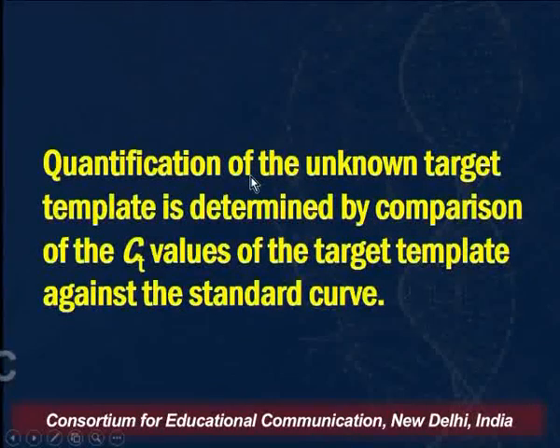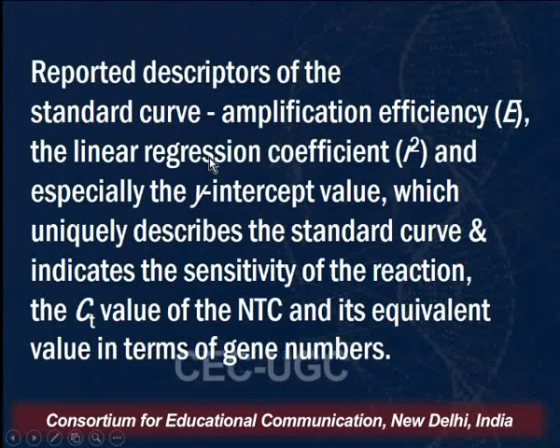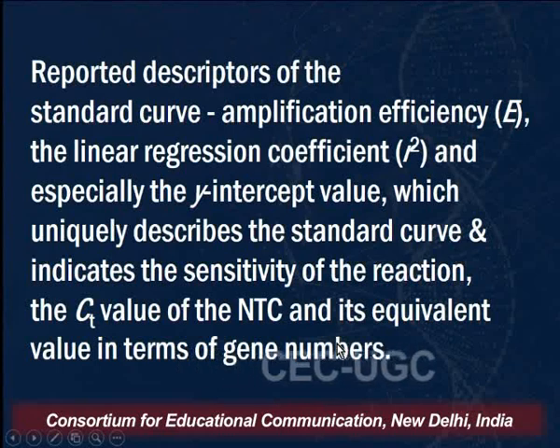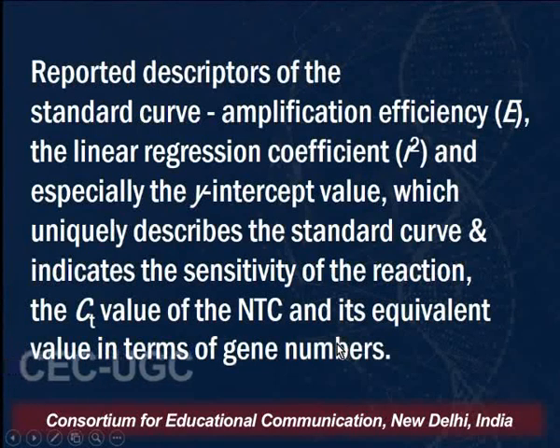As I said, some of the reported descriptors of the standard curve are the amplification efficiency, the linear regression coefficient, and especially the y-intercept value, which uniquely describes the standard curve and indicates the sensitivity of the reaction. The CT value of the NTC and its equivalent value in terms of gene numbers are also given.